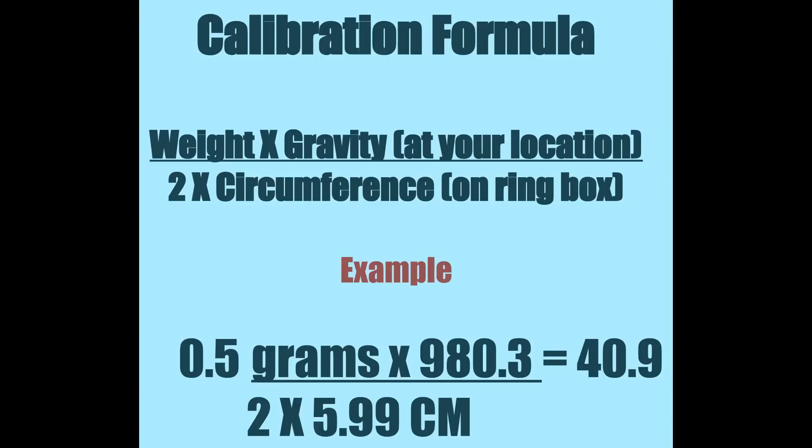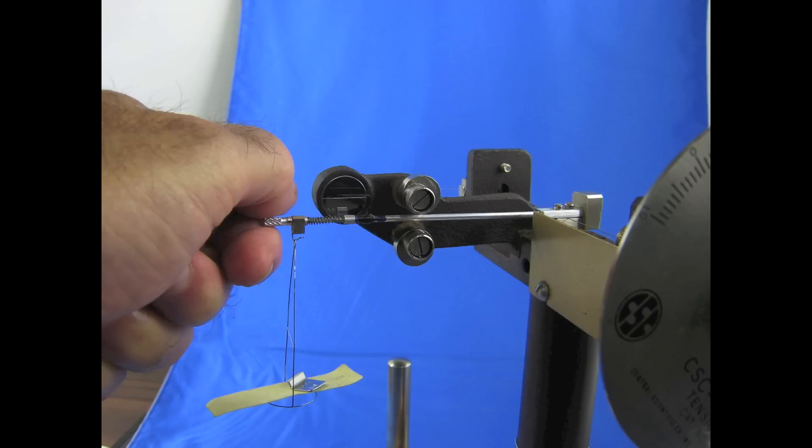The ring circumference is printed on the ring box label. If the dial reading you recorded and the calibrated number are within 0.5 dynes of each other, you are finished. If the two numbers are farther apart, however, you will have to adjust the torsion arm.